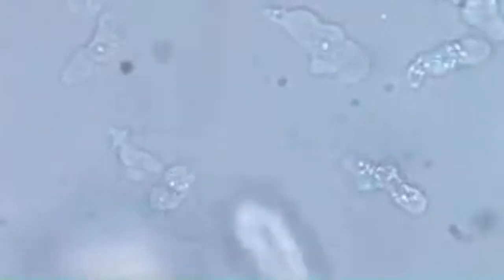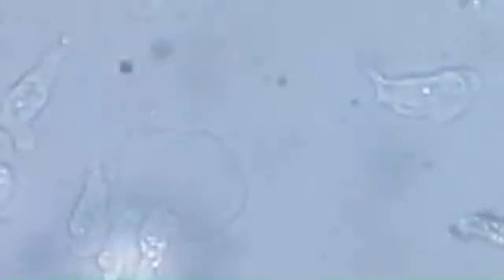You see that big one coming down, it's eating less. Despite being so big, it has very little cell inclusion. Probably that shining part is the nucleus. Fascination. The micro world is so awesome and amazing. It never fails to fascinate you. All you need to do is just sit and watch.